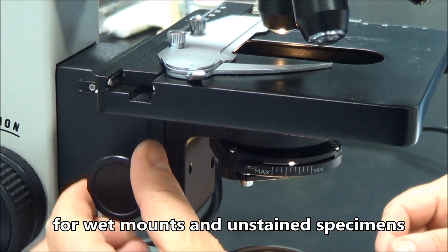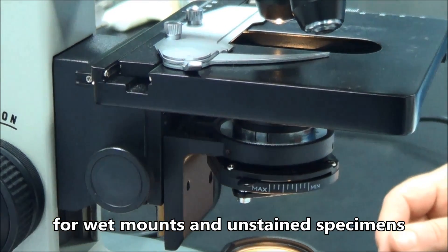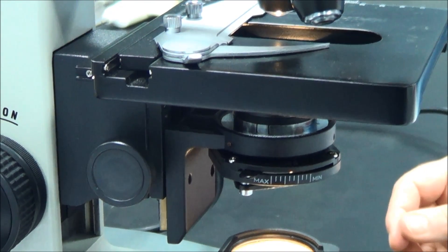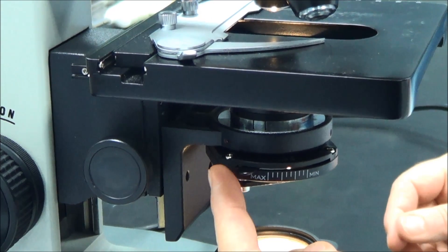For wet mounts and unstained specimens, light may be reduced and contrast optimised by lowering the condenser and adjusting the aperture diaphragm.